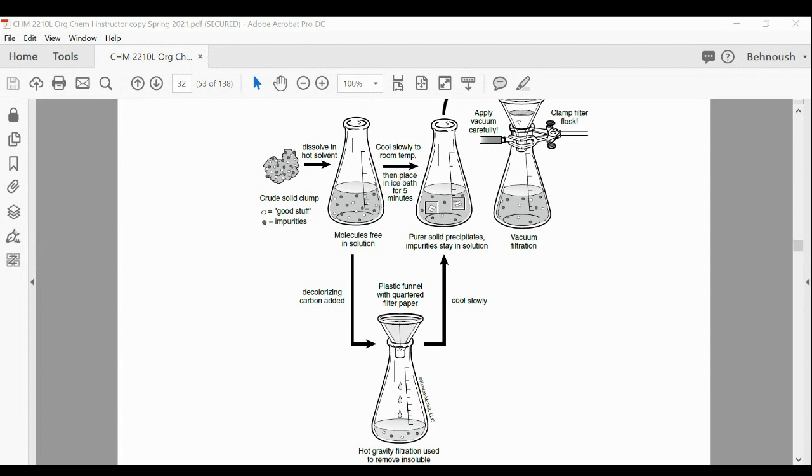Jennifer? Yes, I'm here. Could you tell me what's the characteristic for a good solvent for recrystallization, please?